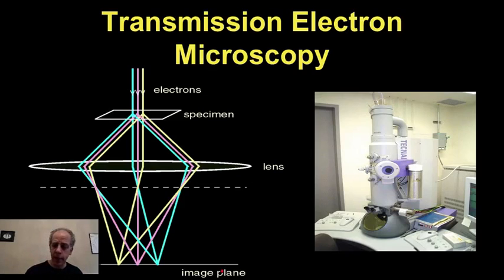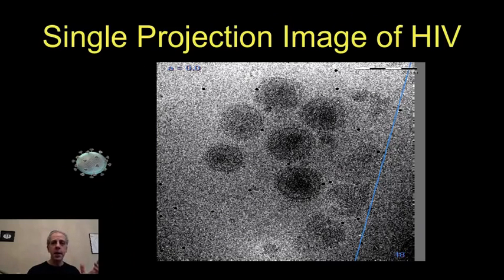So that's electron microscopy. And here is an image of what you will get from electron microscopy. Now remember, always keep in mind, this is what we saw in the previous diagram. This is what we are looking for. One projection of that. So you took this electron microscopy and you basically threw electrons and you have one projection of that, and that's basically what you have here.